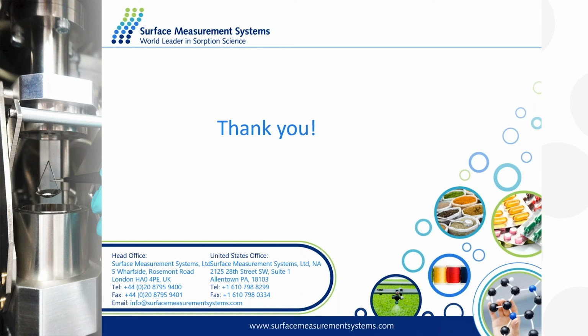All right, thank you. I hope we answered that, Millie. Another question from Bruce. Pharma stability temperatures are typically 25 degrees to 40 degrees. Can you comment on the change of a DVS isotherm on excipients over this temperature range? If I generate an isotherm at 25 degrees Celsius, is it likely representative at 40 degrees?